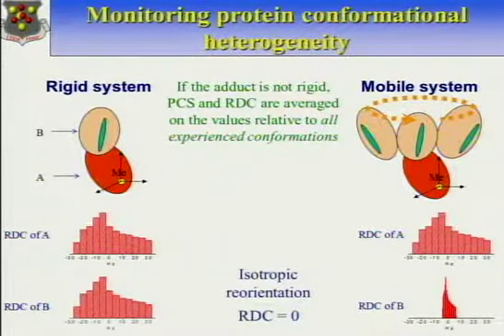So in other terms, because we know that the residual dipolar couplings are an average measurement over all the configurations spanned, and that's why they get reduced in their dispersion, we can try to reconstitute this average by computing, for all possible conformations in a large library of alternate configurations, what the data would be if the system were rigidly in that configuration.